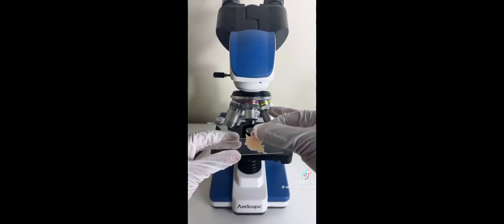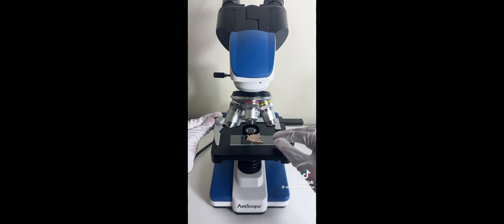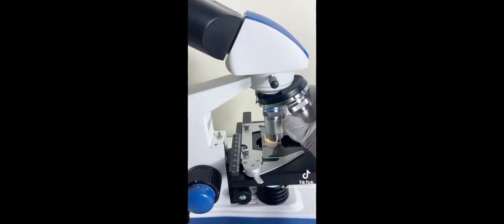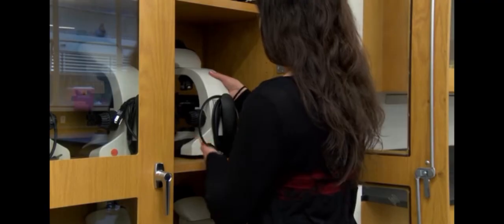Uses of microscope. This device is used for observing microorganisms and their features. In this field, microscopes are used to study bacteria, cells, and many more. These studies help biologists in their study of living organisms and their cell structure.